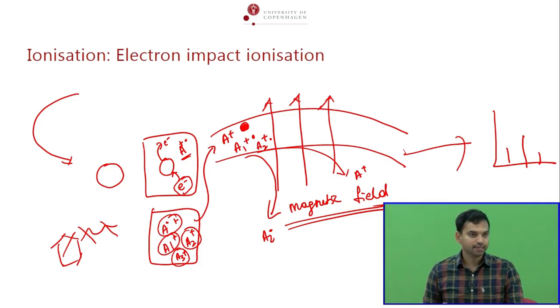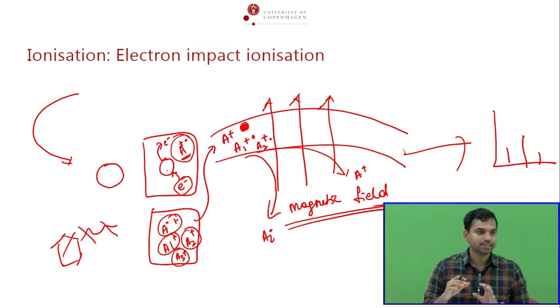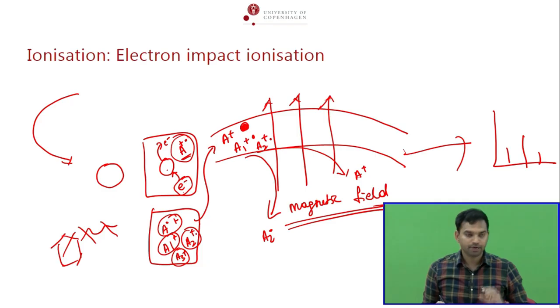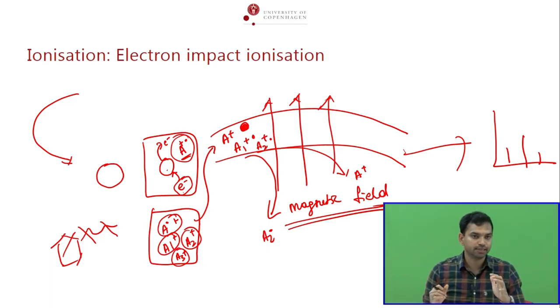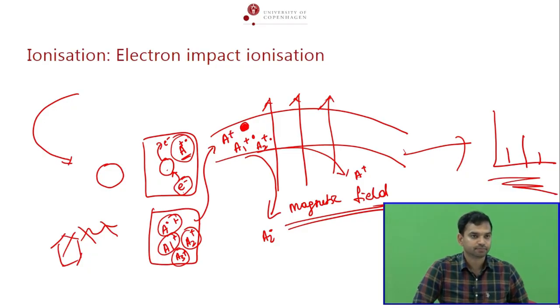So you have a high energy electron, it hits the analyte, then the analyte can get a charge. But it not only gets the charge, sometimes it will also break the analyte into multiple pieces. Then you get a bigger fragment, smaller fragment, and so on. And all the fragments will enter the mass analyzer here. And under the vacuum, under the high magnetic field strength, they will separate spatially based on their mass by charge ratio. And at the end of the day, you can detect them as an MS spectrum. Is it clear? Are you getting my point?